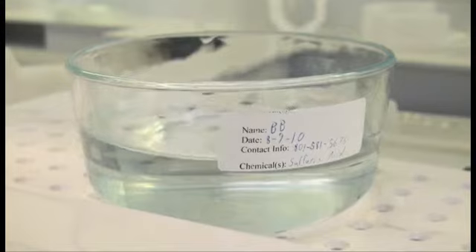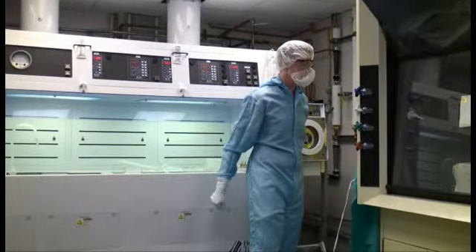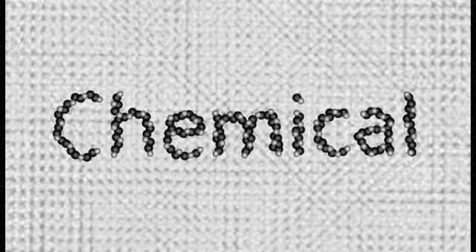Occasionally, it may be necessary for you to leave a chemical dish or container of chemicals unattended. If this is the case, then make sure to label the container using a label from one of the sheets posted at the wet benches. Include your name, date, a way to contact you, and the name of the chemical in the container.